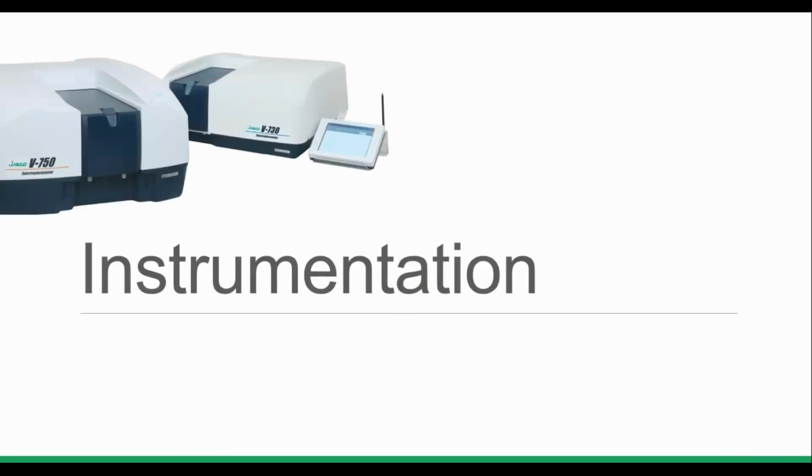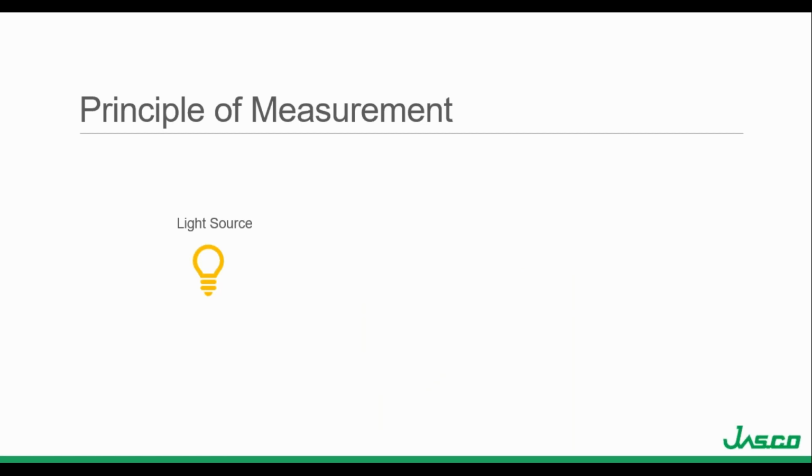So now I'm going to get into the instrument itself. The principle of measurement for a UV-Vis instrument is relatively straightforward and consists of a light source, a dispersive element, a sample, and a detector.